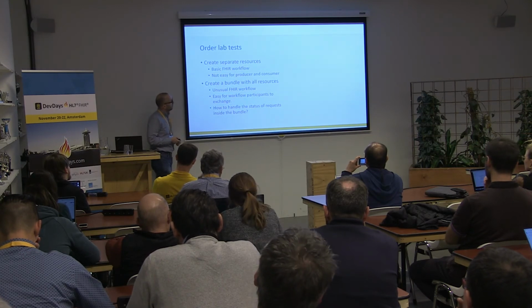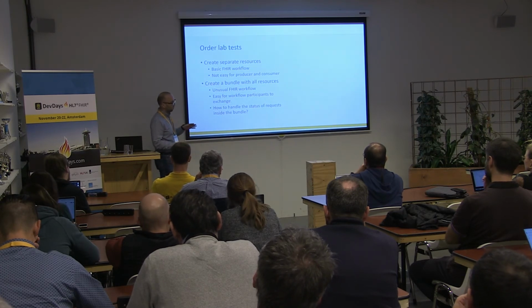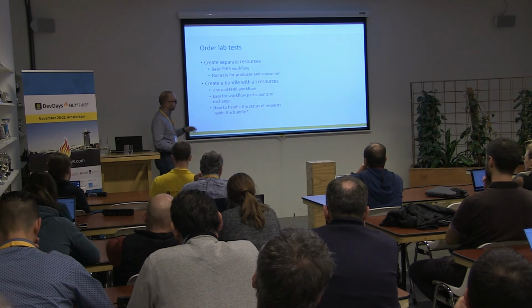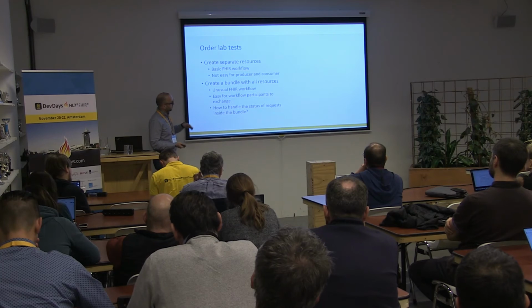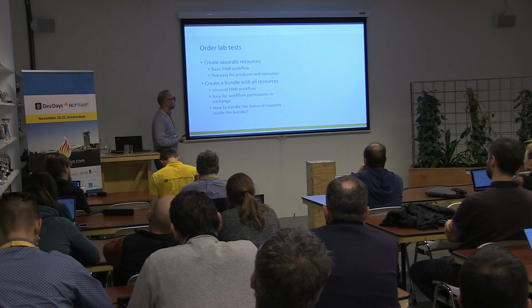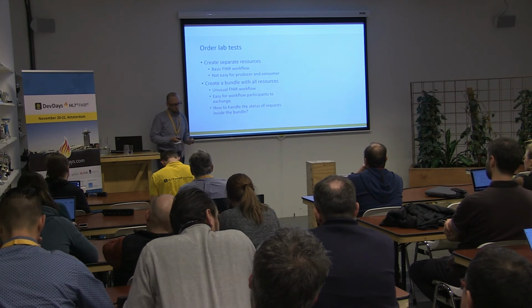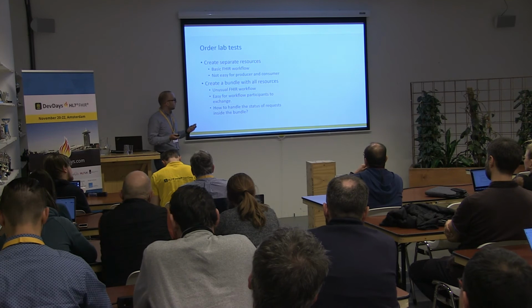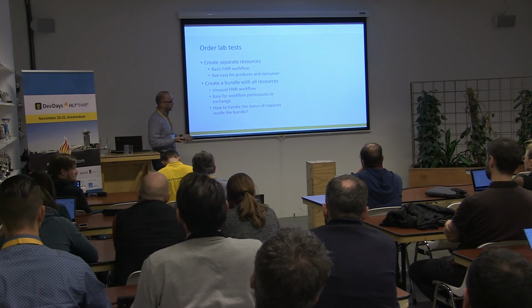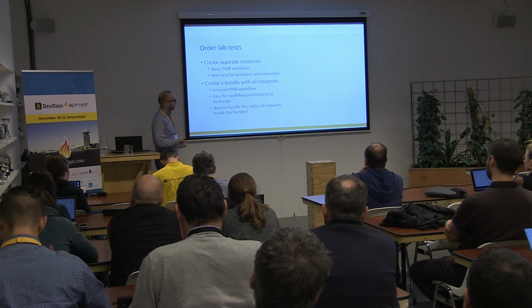And they asked for another type of interaction, where customers send a bundle, like a document, with the description of all tests that should be done and the description of all specimens for these tests, and we generate a task to process this bundle at once. And it's much easier for the customer to receive only two resources and not so many of them.